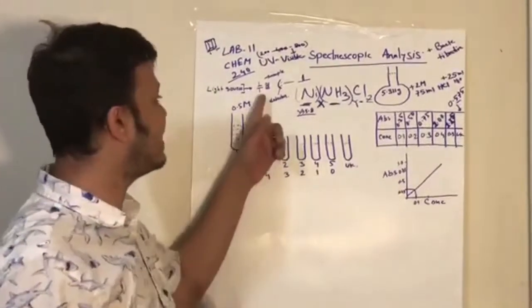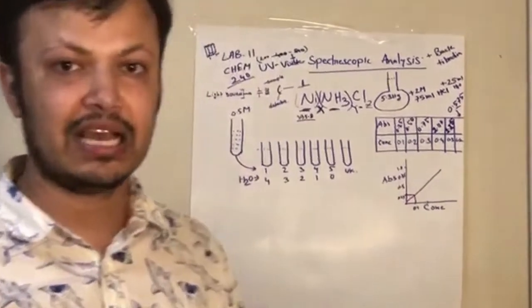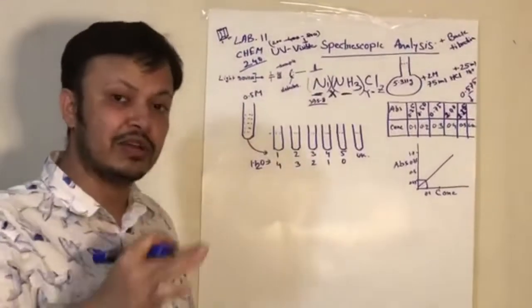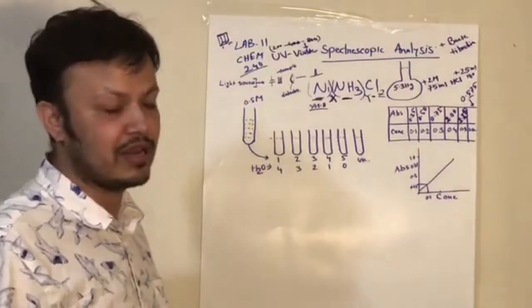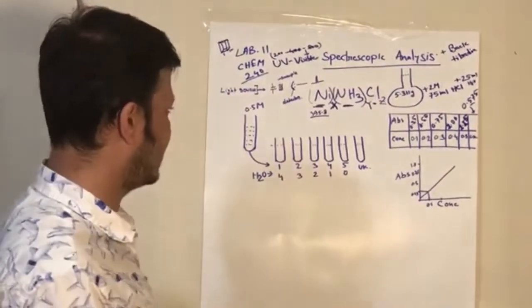So with the increasing of the concentration, the absorption also increases, and this law is called the Beer-Lambert law. Okay, you will learn it. So Beer-Lambert law, I think Dr. Zhao already discussed it in your class.